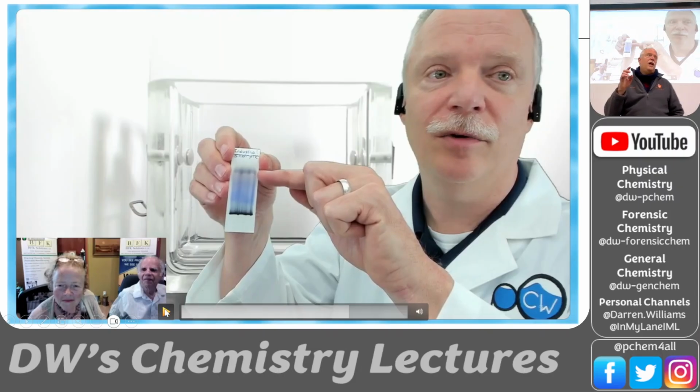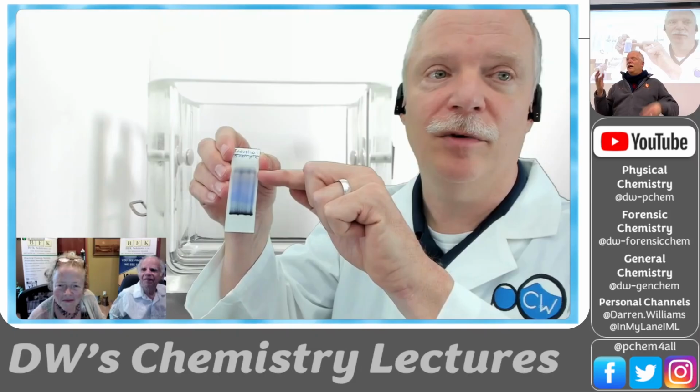Now, sometimes in organic, if you do a synthesis and you've got almost no product, you can put a little drop on the thin layer chromatography, and do the elution, and you can see I've got 3 spots. I've made 3 compounds. And the really good organic chemists will scrape that spot off of there and send it to the NMR or whatever. They'll analyze just that tiny amount that they made, and if they're really good, they can scrape it off, and then use that in a subsequent reaction in a micro reaction.